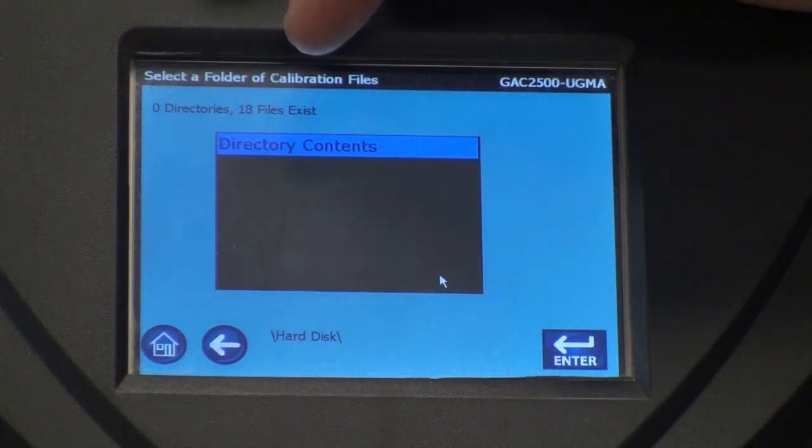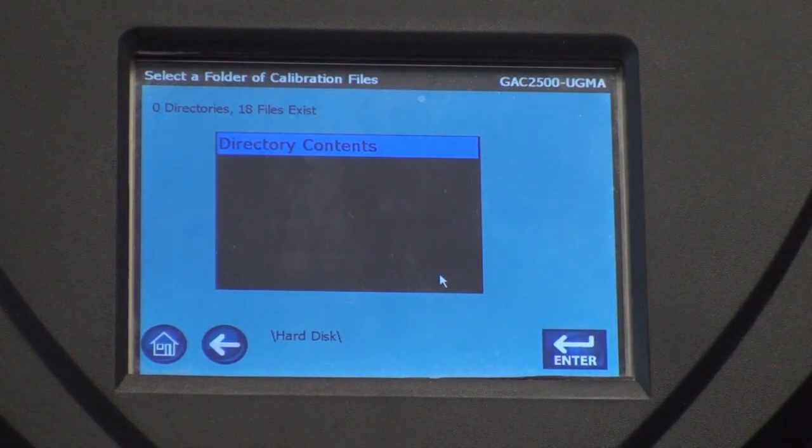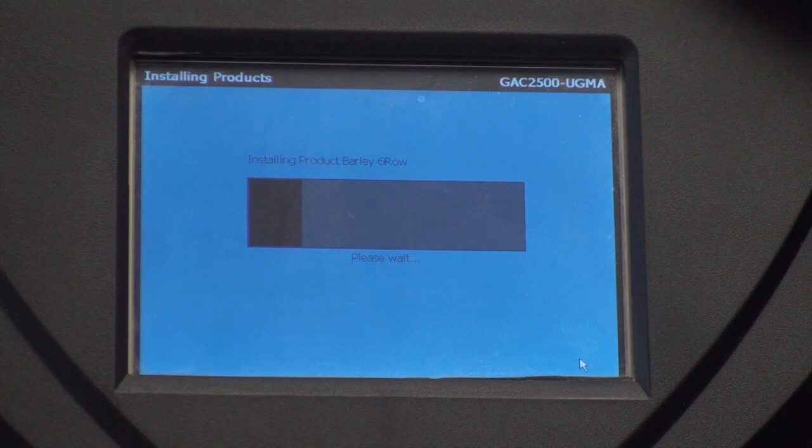There's nothing to do as far as menu navigation. If those are the files and you're sure that these are the files you want on this machine, press enter and it will load them all automatically — until it gets to the one that we preloaded, and it will stop at that one and ask you if you want to load that file over the existing file or if you want to skip it. We'll get to that in just a second.